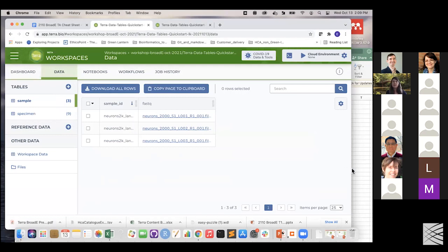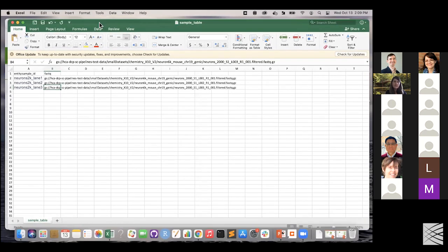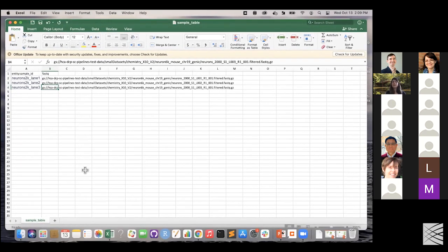So I'm going to give you all 5 minutes now to do this same exercise. I'm going to keep sharing my screen so that you can see the Excel sheet. But go ahead and make your own data table from scratch. We'll give you until 2:14 to do this. And please feel free to ask questions as you're doing this. Any issues that come up, if you have a question, most likely everyone else will have a question too. So please don't be shy to unmute yourselves, ask questions, or use the chat and directly message TAs or everyone in the chat.